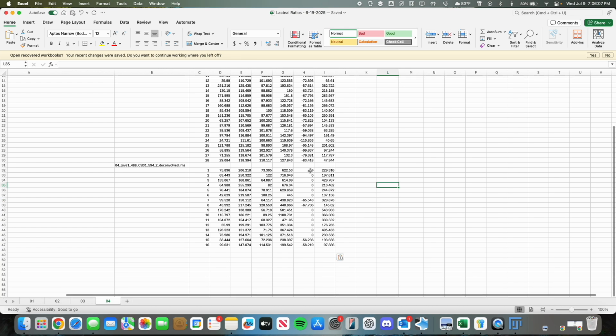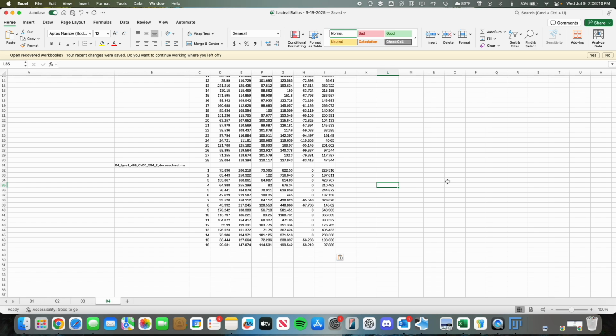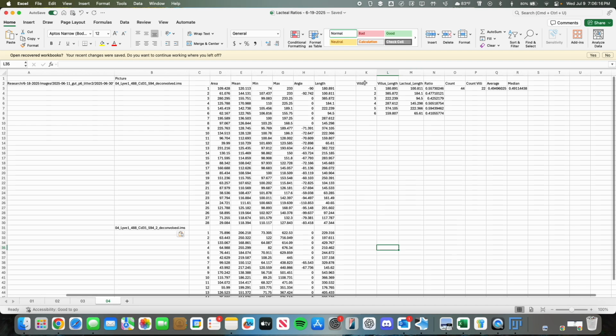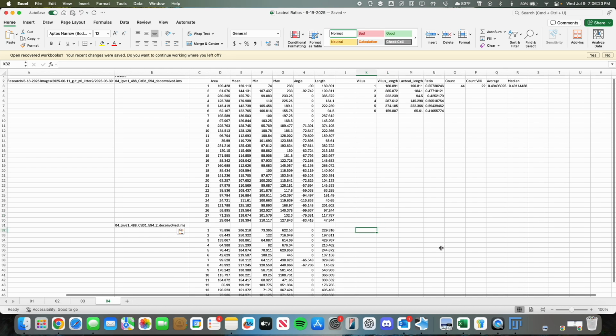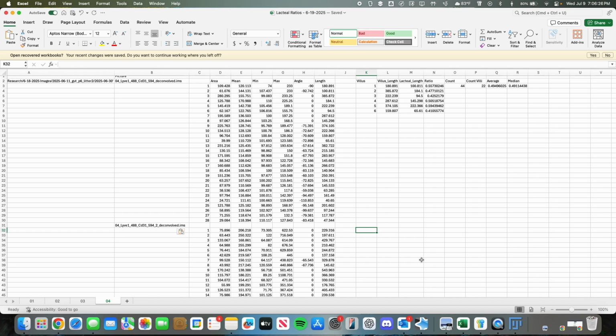But in general, I just like to take these values into ChatGPT and sort them according to the first value and the second value, so it's easier just to input them. So we're going to go ahead and number the villi. So we have 1 through 16, which means if we divide that by 2, we have 8 of them. So, an easy way to get these numbered quickly.